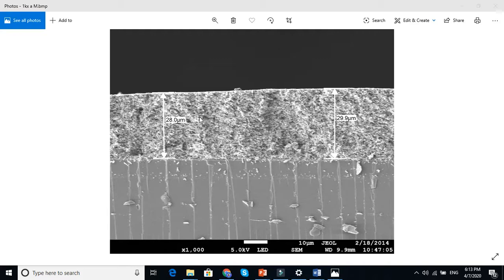That is called a paint, like when you are painting the wall. So when we prepare paste, we just put it on the FTO, that is the glass FTO, the below one.